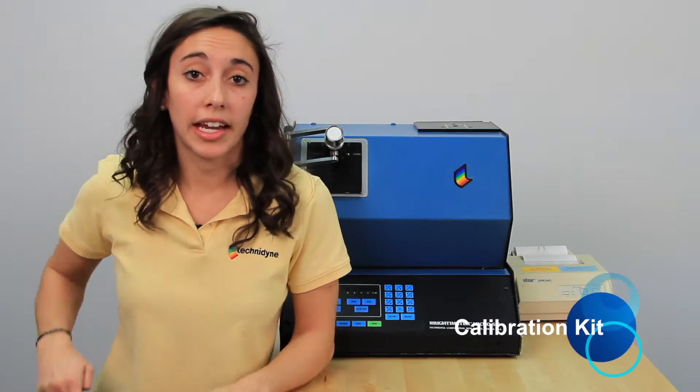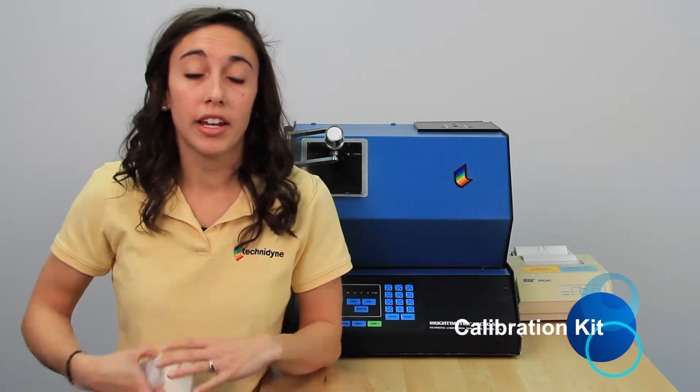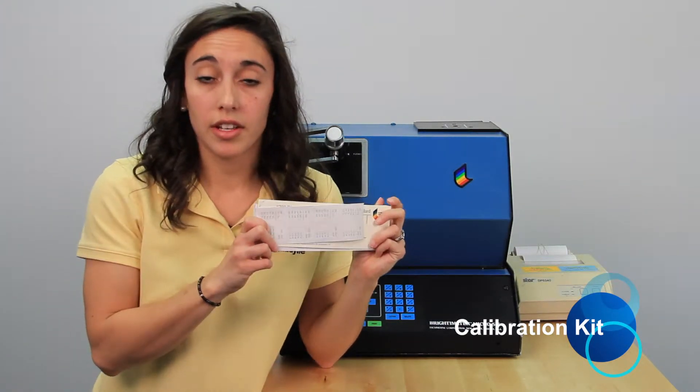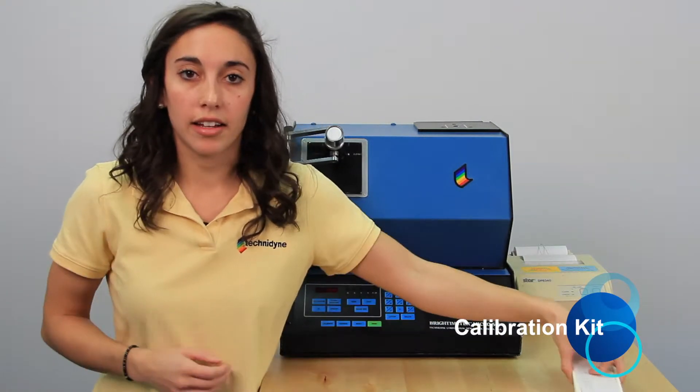The first thing you'll need to have on hand is your calibration kit. Inside that calibration kit, you'll find five sets of calibration standards: there's a 50, a 60, a 70, an 80, and a 90.